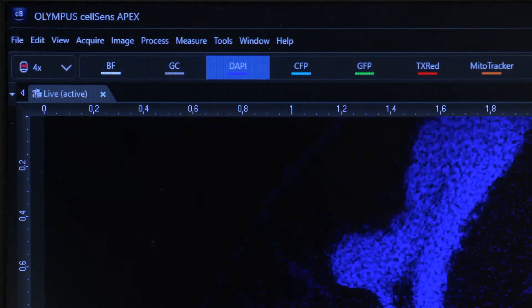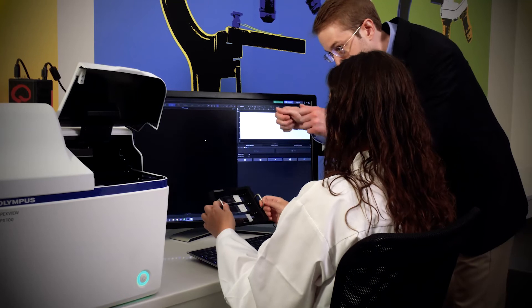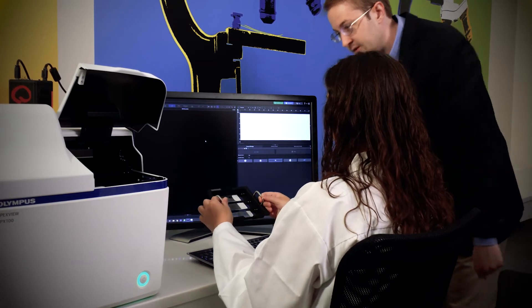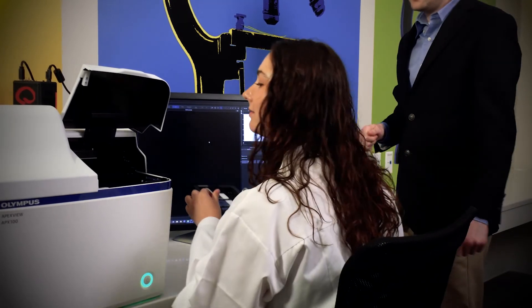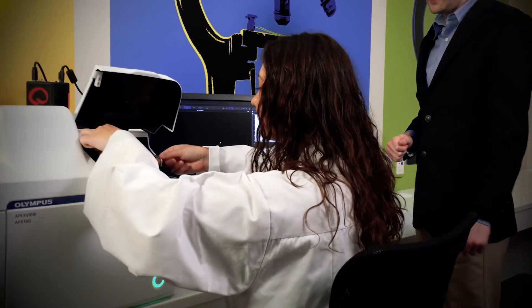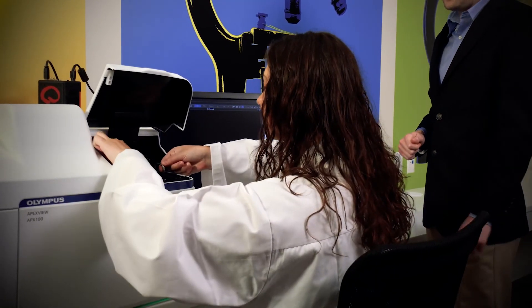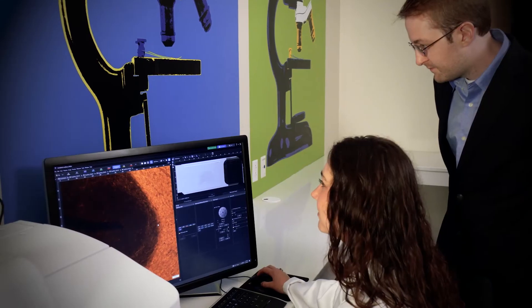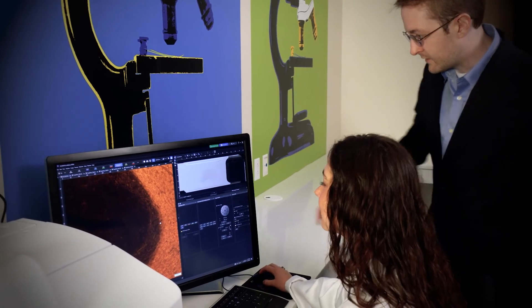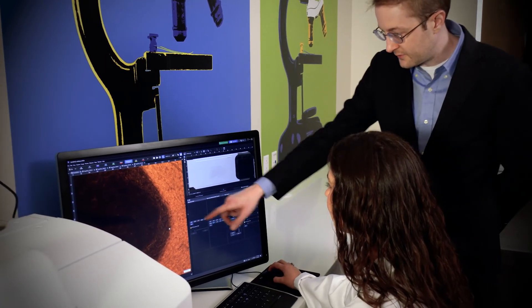The APX100 with CellSense APEX software's intuitive workflow reduces training requirements compared to conventional microscopes, saving you time and money.